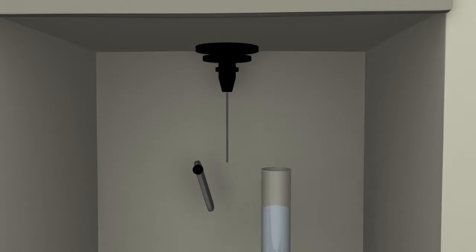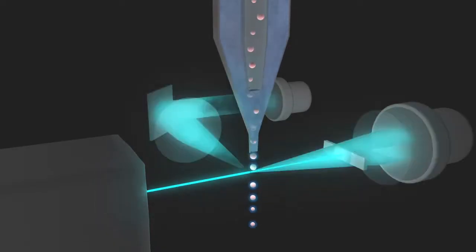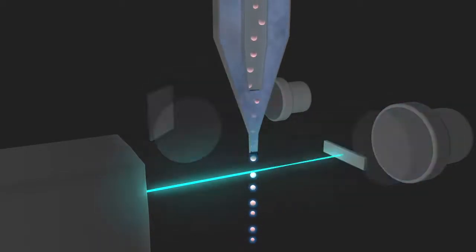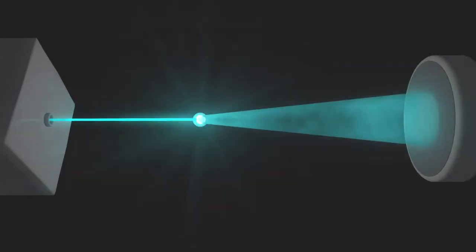Once a sample has been placed in the flow cytometer, the machine will suck up the sample, mix the sample into a stream of saline solution in the cytometer, and lead the cell suspension through a narrowing channel, causing the cells to form a single file line before the cells pass through the laser at the interrogation point. Each cell within the sample then moves across the laser beam, allowing each cell to be individually analyzed. As each cell passes through the laser beam, the light will scatter in multiple directions.